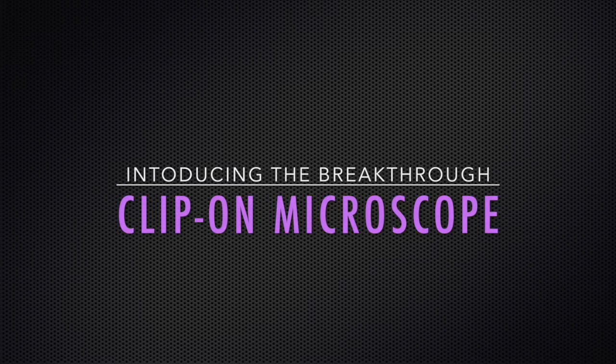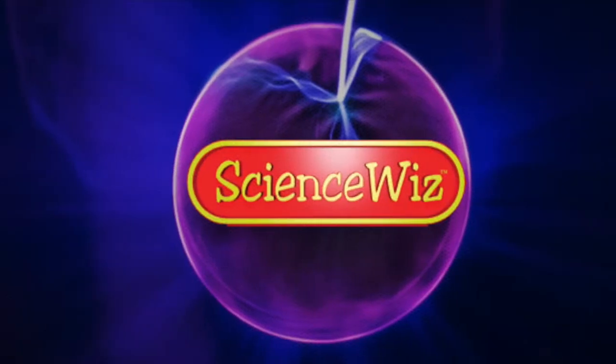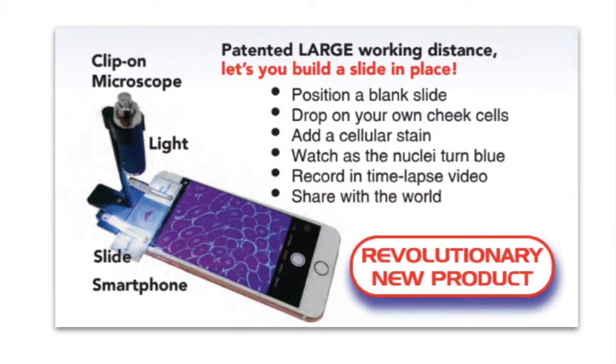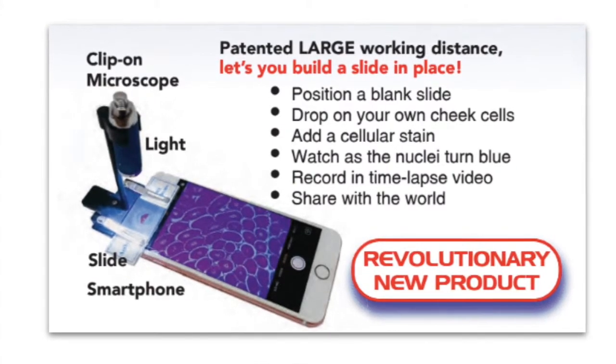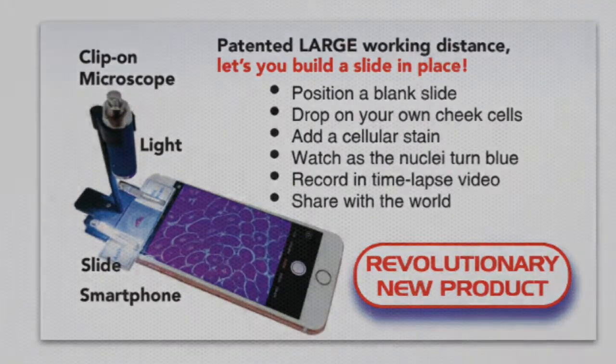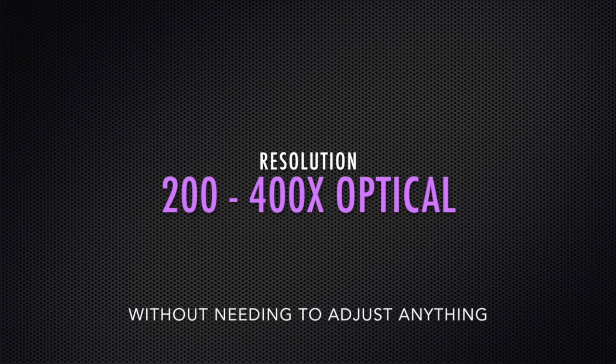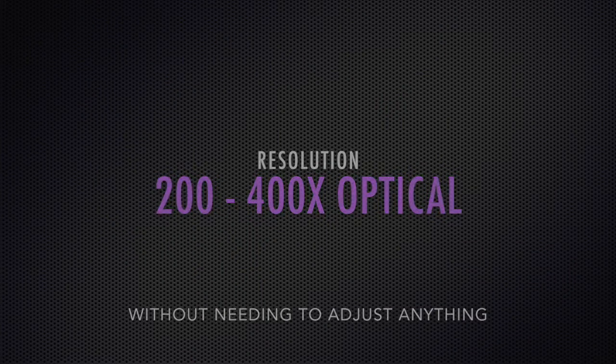Introducing the Breakthrough Clip-on Microscope, new from ScienceWiz. The Clip-on Microscope is a truly revolutionary new product. It works with any smartphone or tablet. The built-in resolution of the lens is 200-400x optical without needing to adjust a thing.